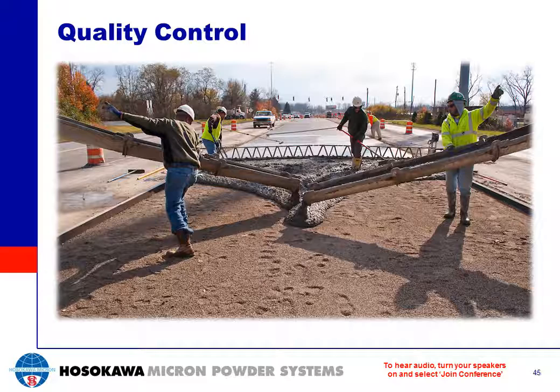Knowing and defining the particle size distribution in your product can have a huge effect on the quality of the product. For example, some companies will take a sample every 15 minutes from the material being produced on their mill. This will ensure that the mill that they are using is producing a consistent product.